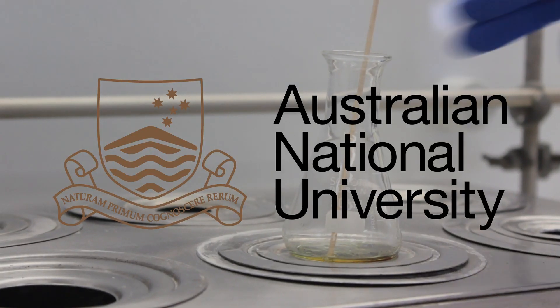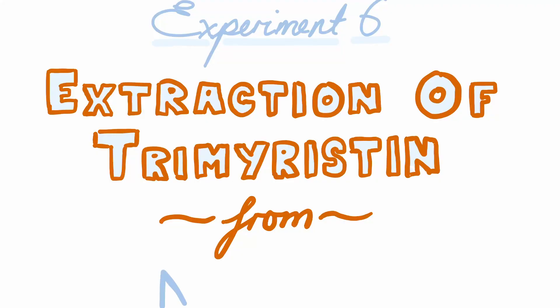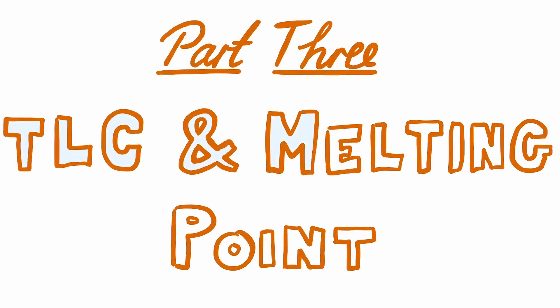This video is brought to you by the Research School of Chemistry at the Australian National University. We're going to run a TLC of our two products from part 1 and 2 and compare them to some standard solutions to assess their purities.